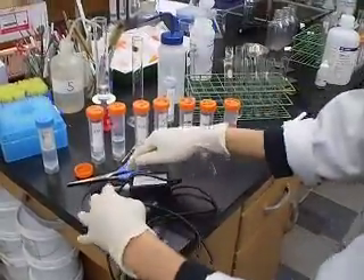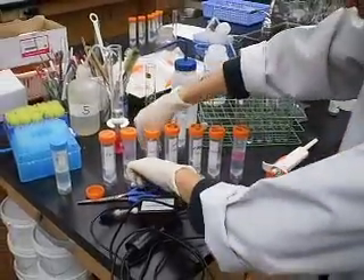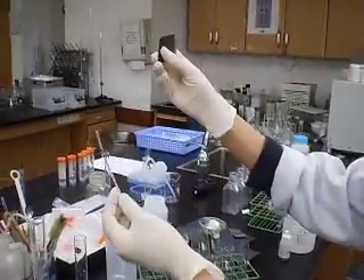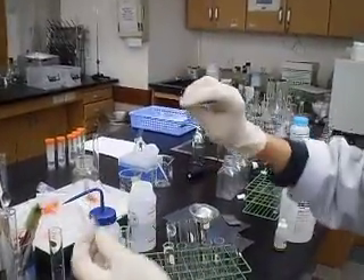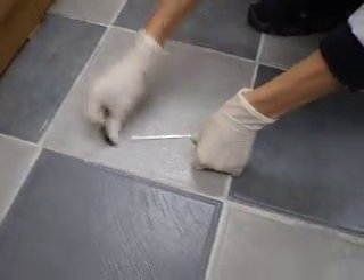That will be the next part of the tutorial. So what we're going to do is get the magnesium ribbon strip and use a piece of sandpaper. I'm going to polish it on the floor to remove the oxide layer.